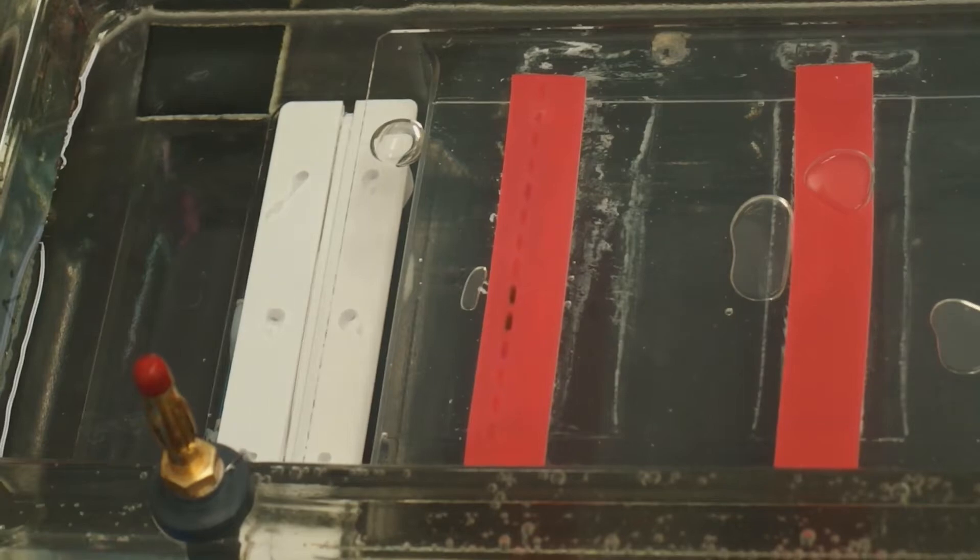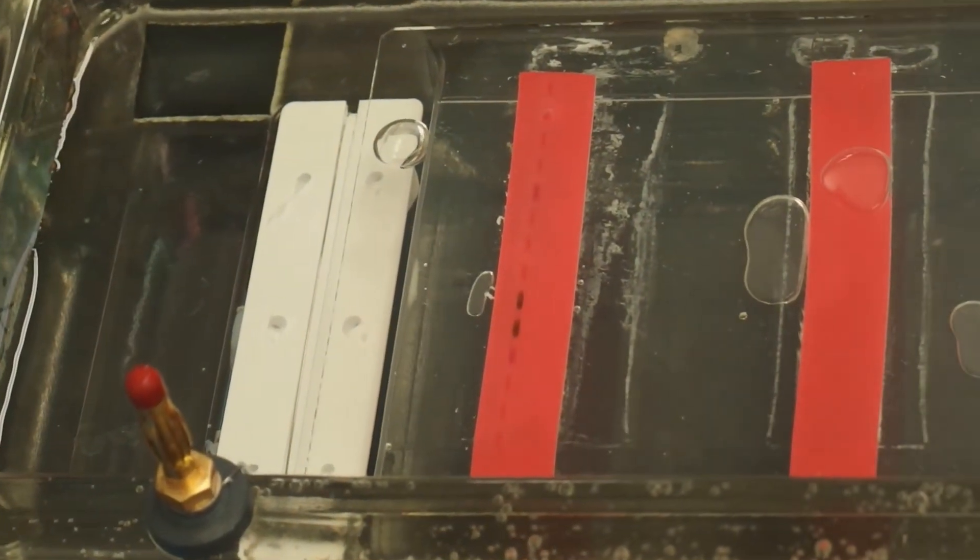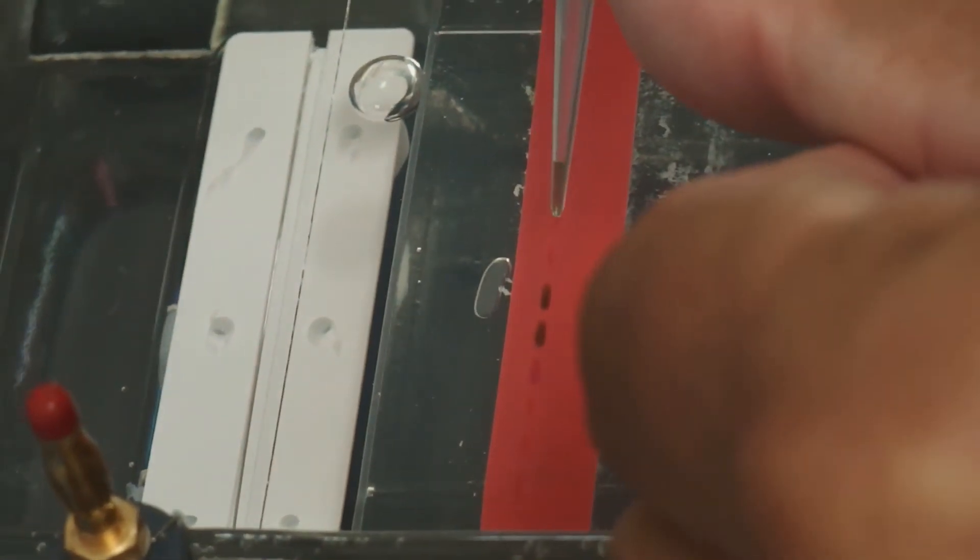Obviously, we don't want to poke holes into our agarose gel, so the objective is to get the pipette tip into the upper portion of the well without jabbing it through the agarose.